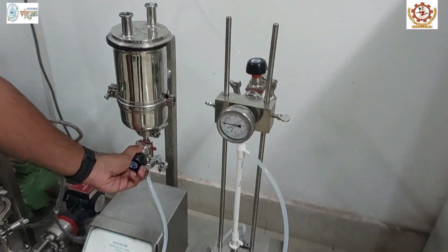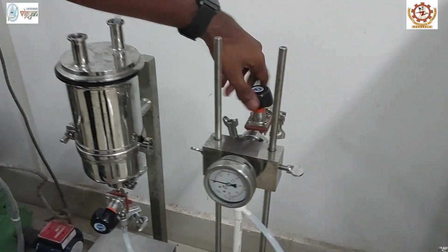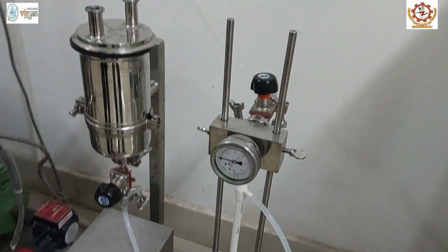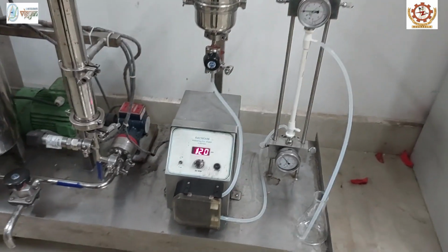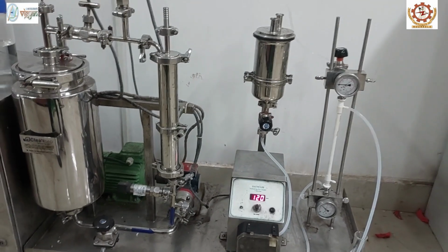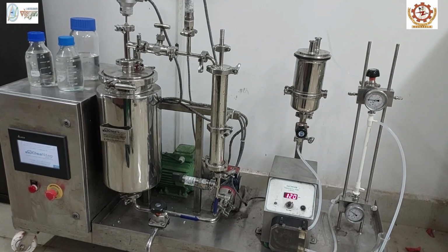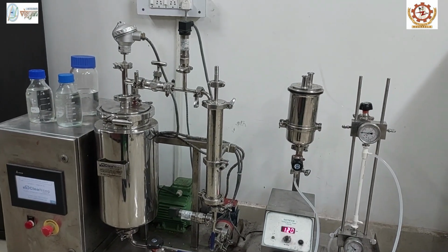Once it is on, make sure that the inlet valve is open. There should not be any transmembrane pressure during water wash. The water wash will be done for approximately 30 to 45 minutes.